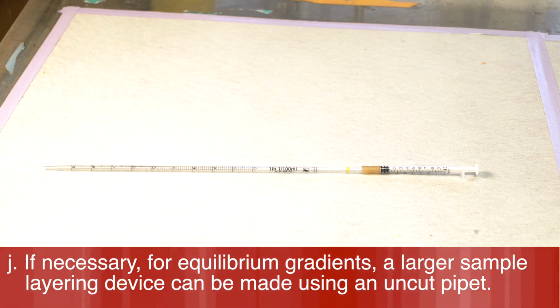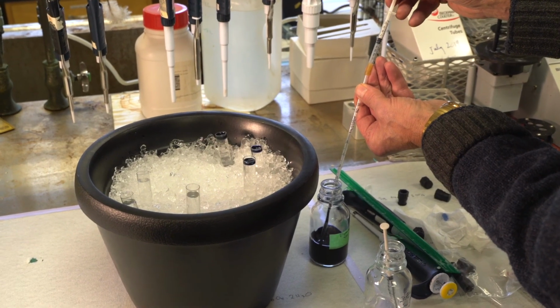If necessary, for equilibrium gradients, a larger sample layering device can be made using an uncut pipette.